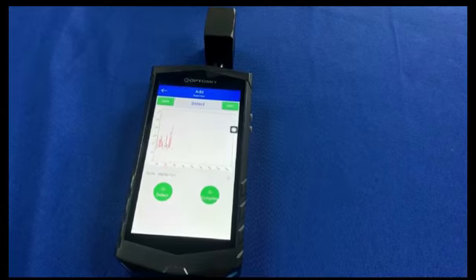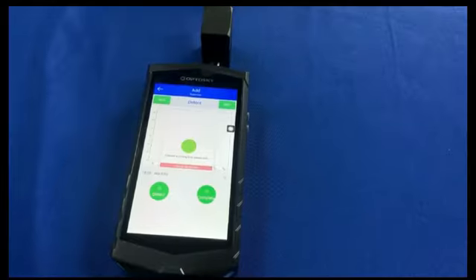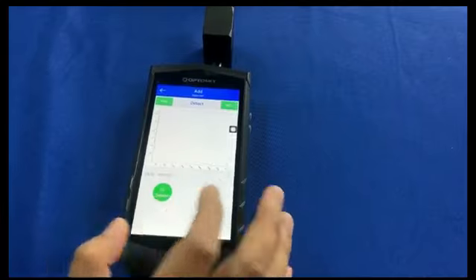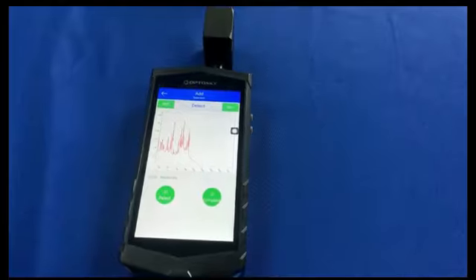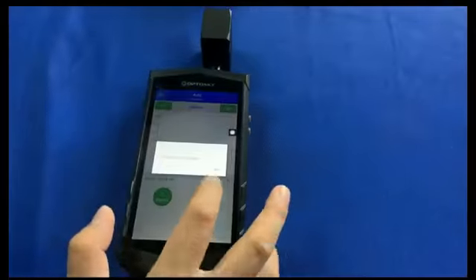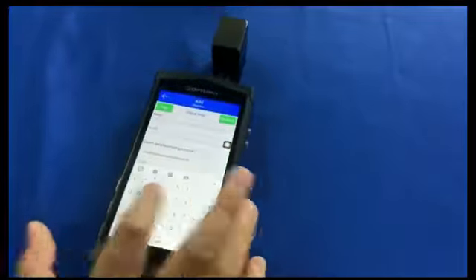And then we can log out and log in as operator. Select method. You use the operator to log in, and input a password.